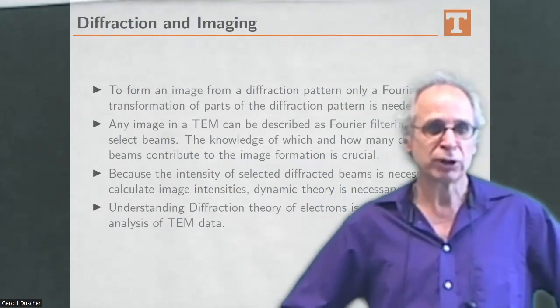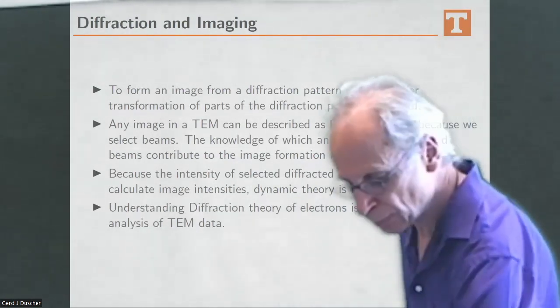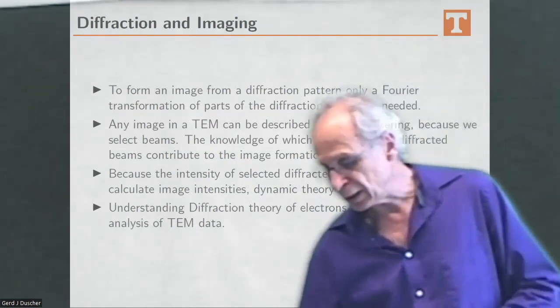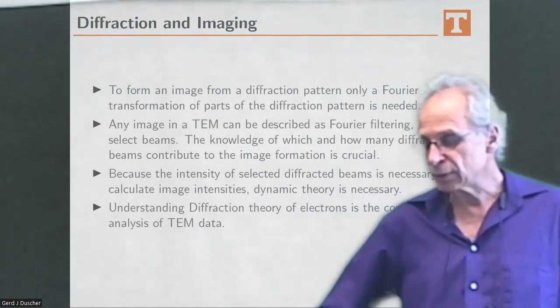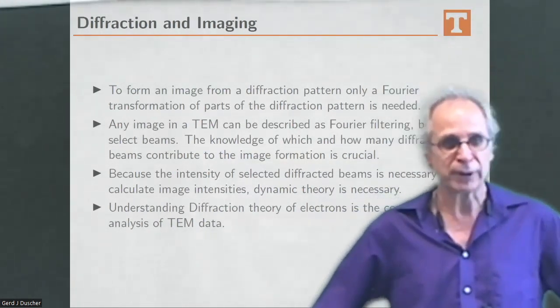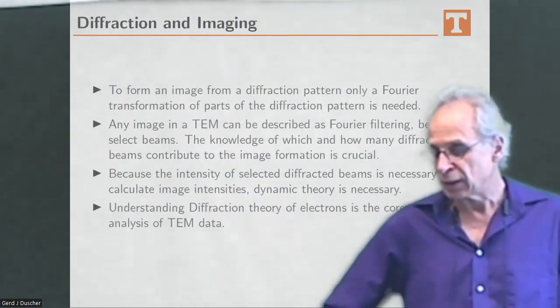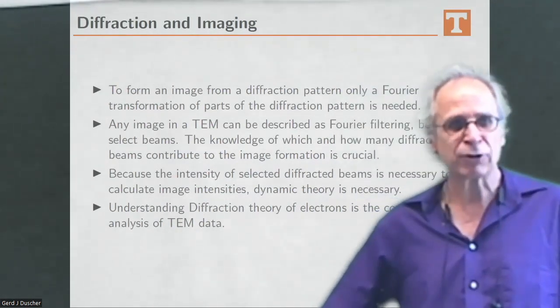We will do Fourier analysis today on our samples, with our notebooks, and so we'll see how powerful that is. Of course, everybody knows that, but we also want to make it convenient and easy to use, right?